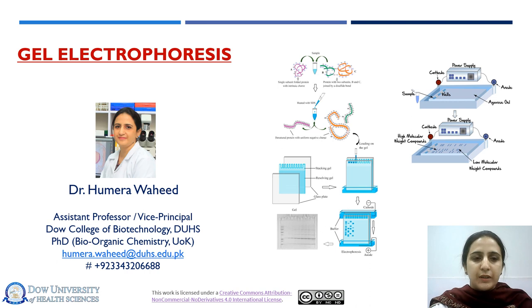In today's lecture, I'll be discussing gel electrophoresis, which is a very simple, rapid, and sensitive analytical technique used for the separation of charged molecules, particularly biomolecules like proteins, DNA, and RNA.